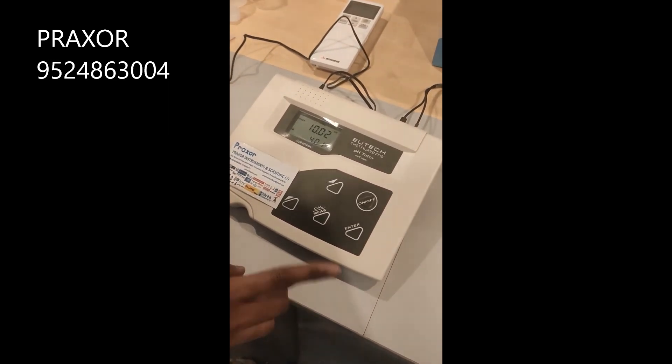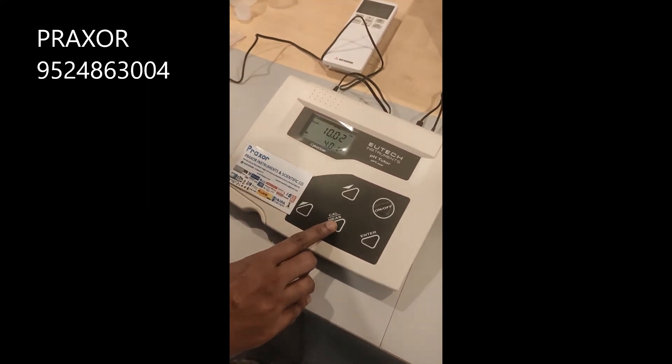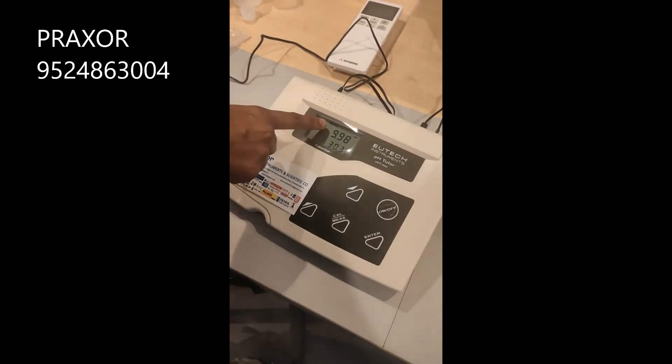Once the two calibrations are done, press the same CAL key to switch back to measurement mode — the CAL and measurement key are the same key. Just press it and the instrument will come to measurement mode.